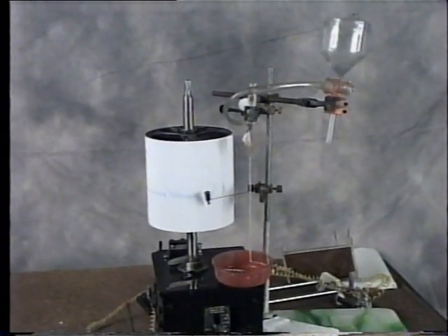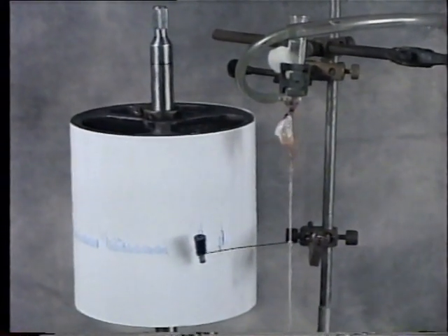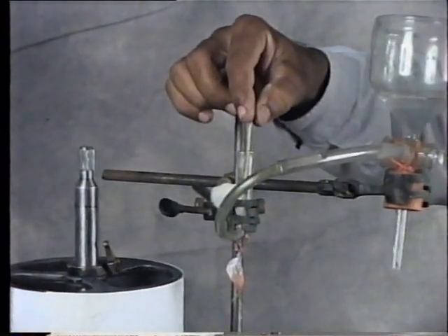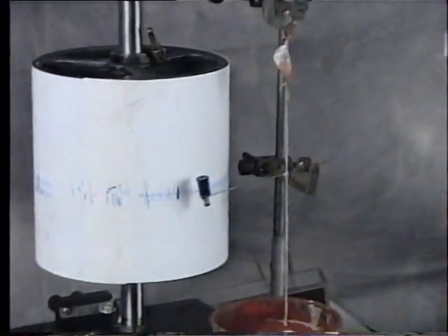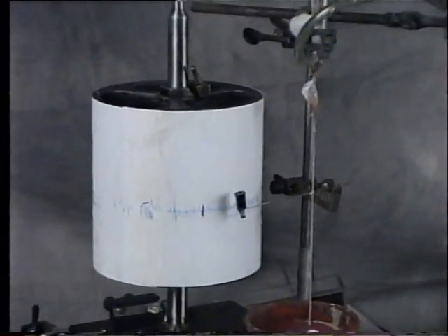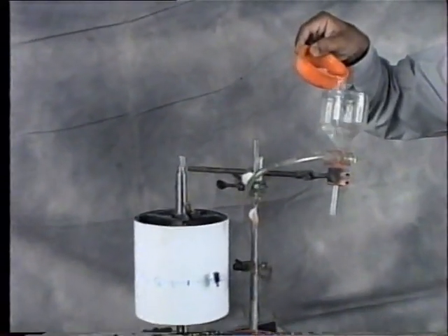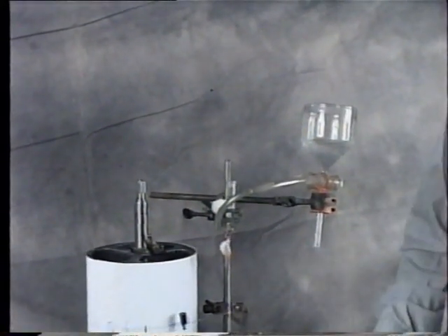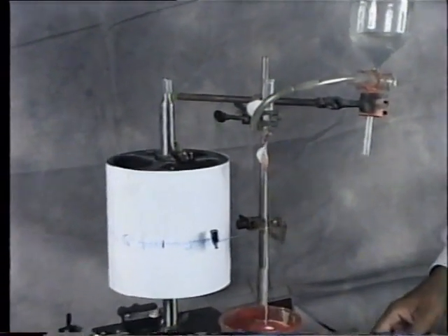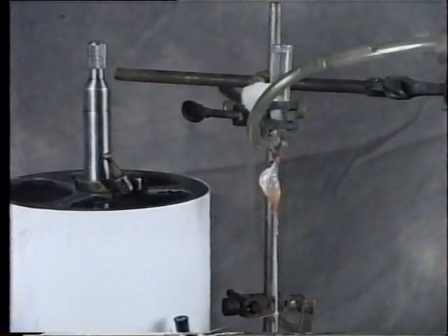To check the patency, introduce a needle into the cannula to reach the heart. Now fill the funnel with Ringer's solution and observe the heartbeat recorded on the drum. This shows the normal heartbeat.